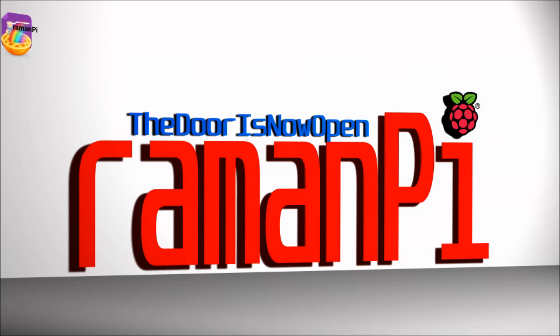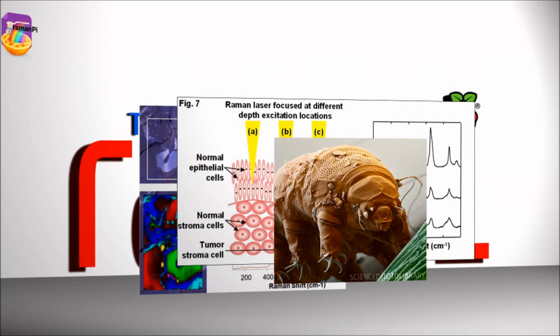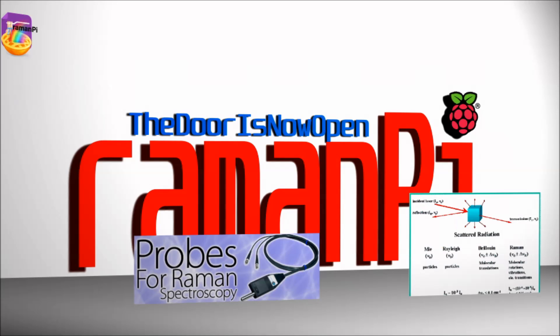There are a number of uses for ramanPi as a whole, as well as for many components within the device. The entire system has many applications such as mineral identification, cancer research, biological studies, and a ton of others. You can extend that by adding future expansions I have planned, such as fiber optics, adapters, and side scatter detection.